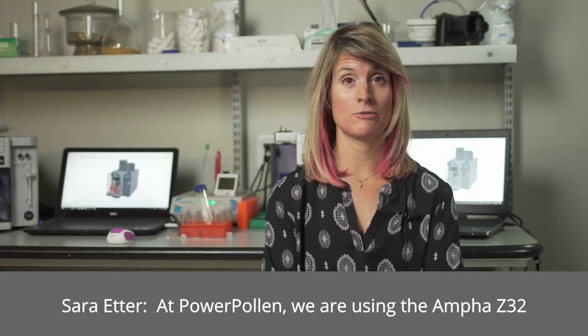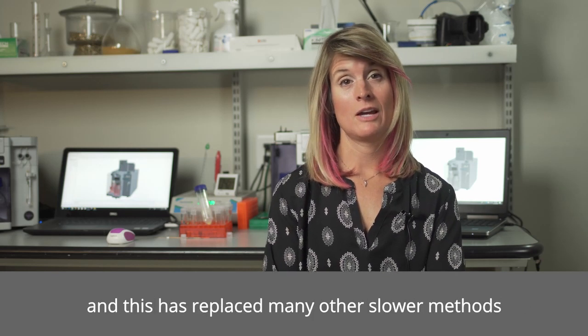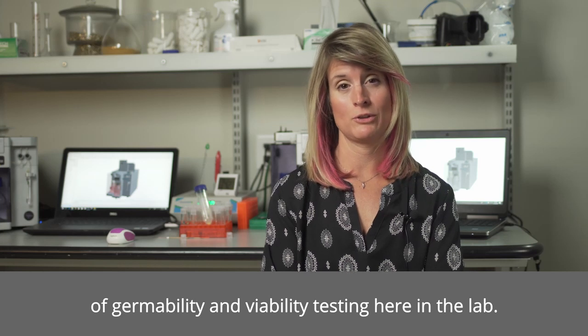At Power Pollen, we're using the Ampha Z32 to get a quick snapshot of the pollen viability at any time, and it has replaced other slower methods of germinability and viability testing here in the lab.